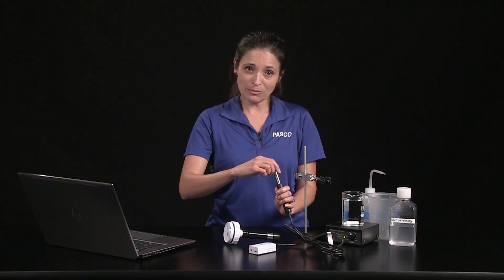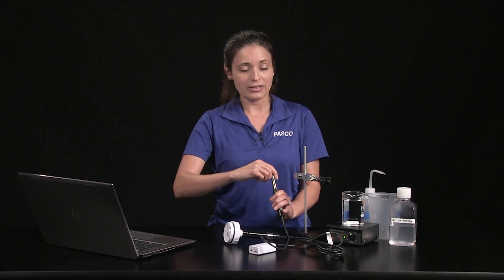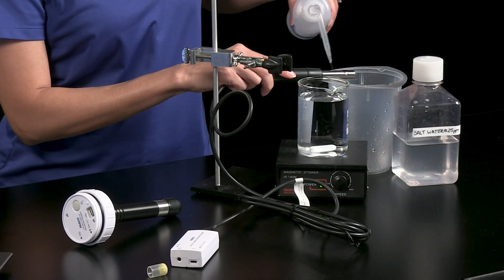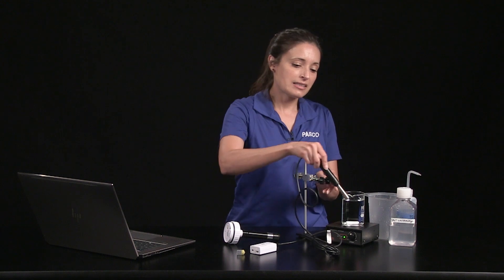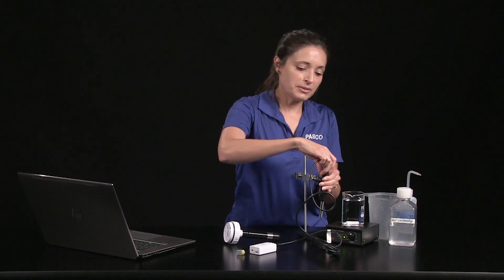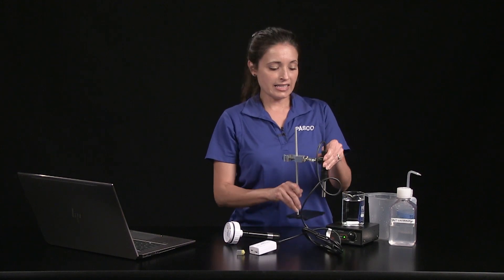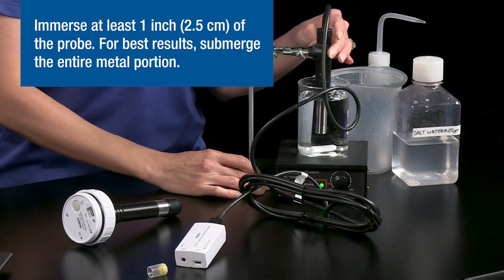Grasp the probe body with one hand and remove the boot with the other hand by turning it clockwise while looking at the probe. I'll rinse the probe and put it in the holder and set it in a beaker of tap water and we'll take a reading.